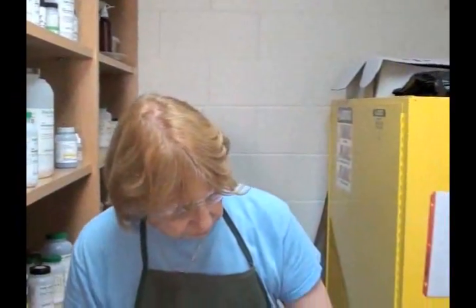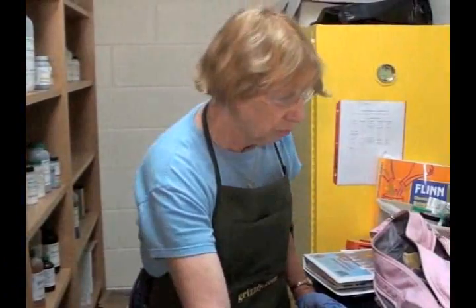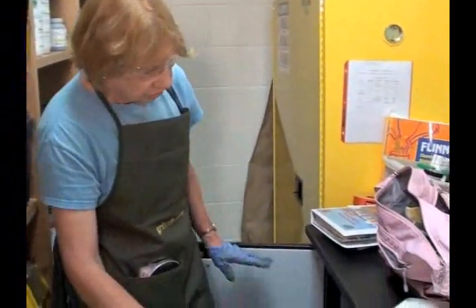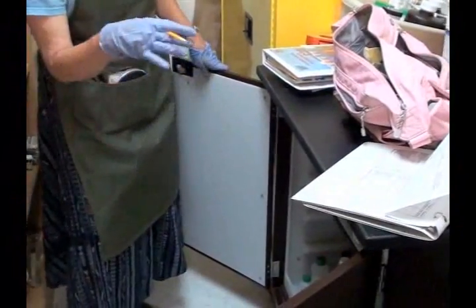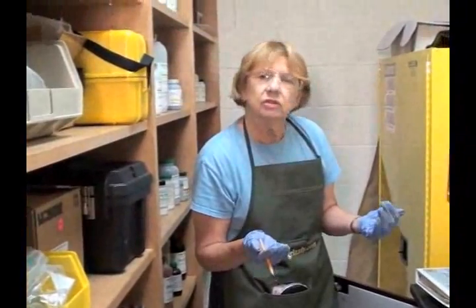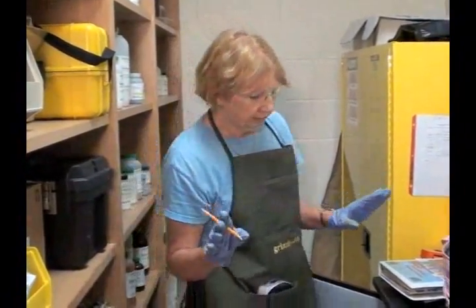This cabinet is their corrosive cabinet, but it's not marked. It should be marked as acid, and it's best if you can have two cabinets, one for acid and one for bases, but if you have only one, let's store acids in it. And here again, this is a common source of problems. They used to make acid cabinets out of metal, and of course, they deteriorated pretty rapidly. So you need to check the condition of your acid cabinet to make sure that if it is metal, the little struts holding up the shelves haven't rusted away, because this can cause a real serious problem when the acids fall and mix together, particularly if you have incompatibles in your acid cabinet.